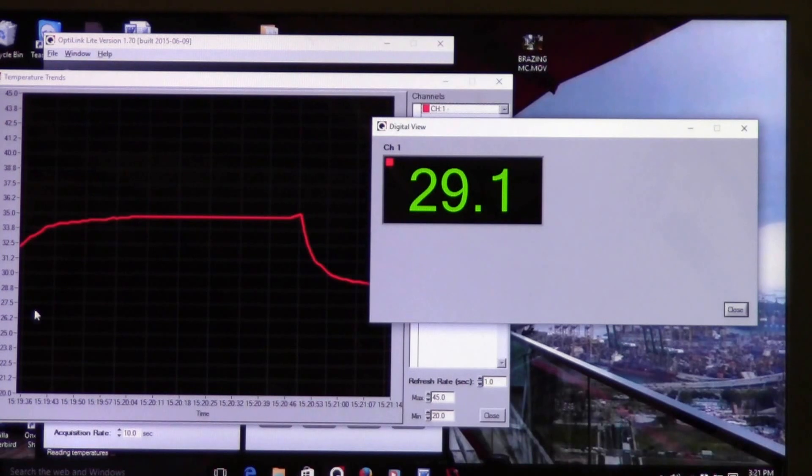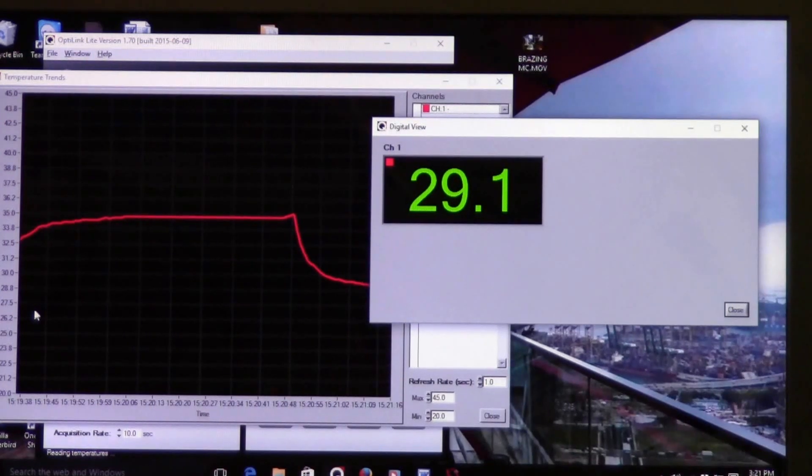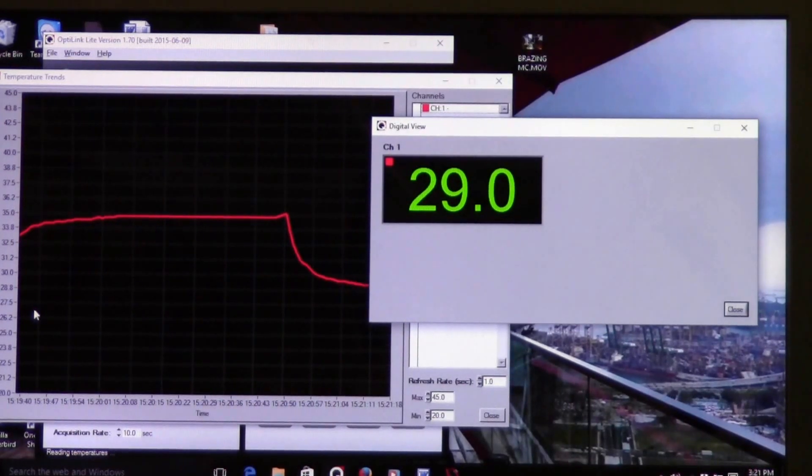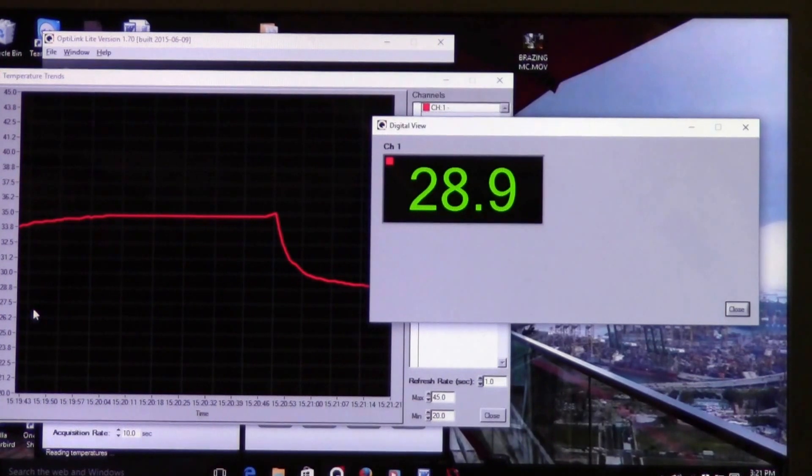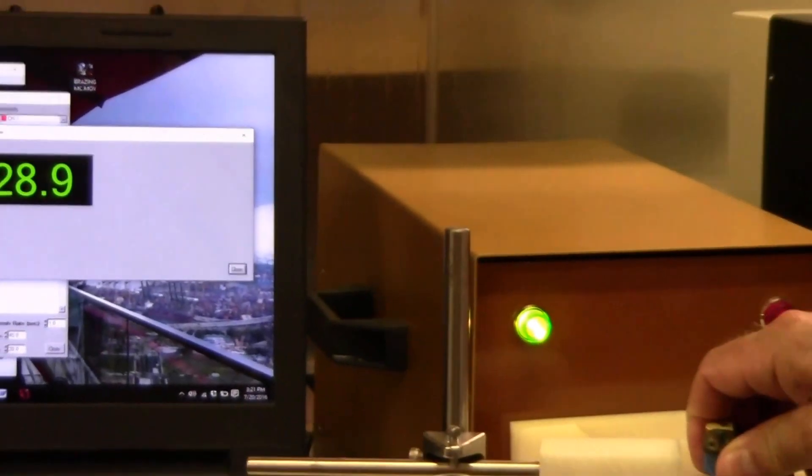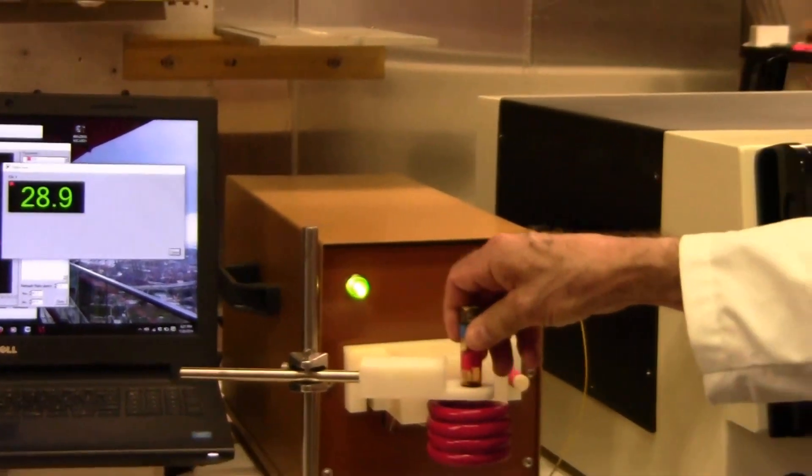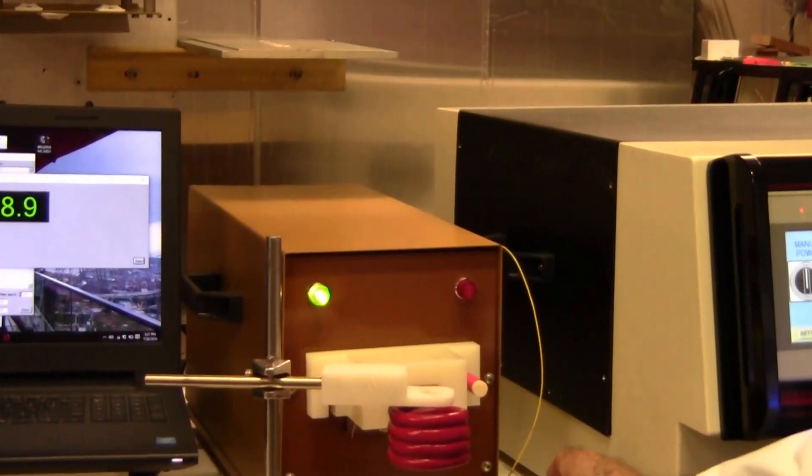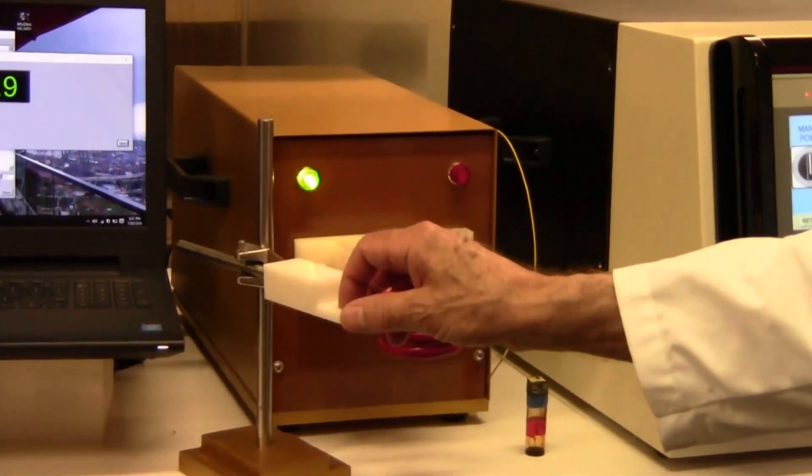Okay, that's the end of the temperature control demonstration. I did want to point out a few things. With each system, we supply this test tube holder, which is very convenient.